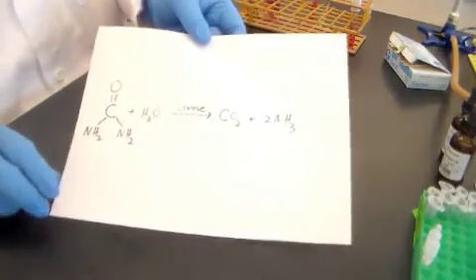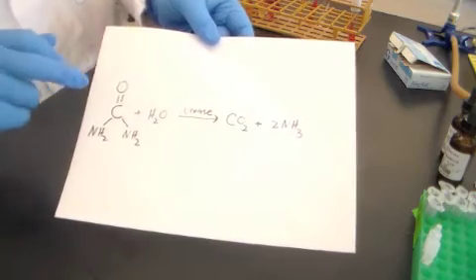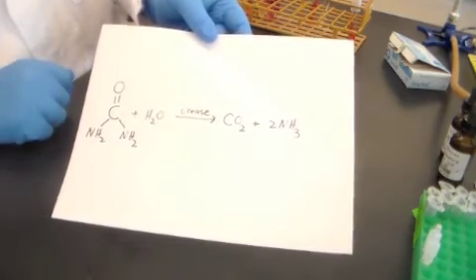If you want to know the actual reaction, you chemistry geeks out there, urea can be broken down by urease into carbon dioxide and ammonia. And again, please read the PDF from the American Society for Microbiology that I posted on the Blackboard site. So that's all you have to do in terms of interpreting your tests from last week.